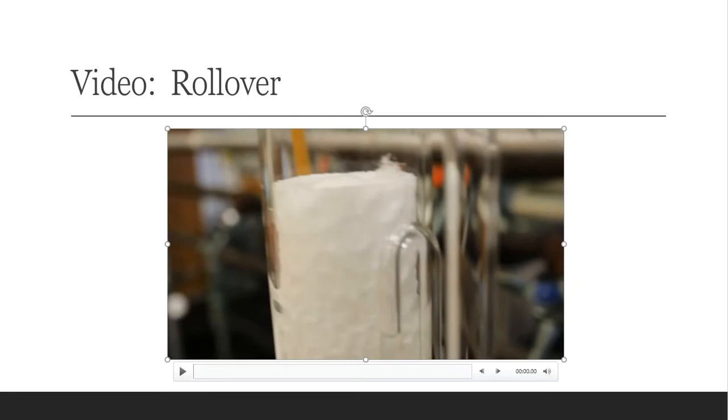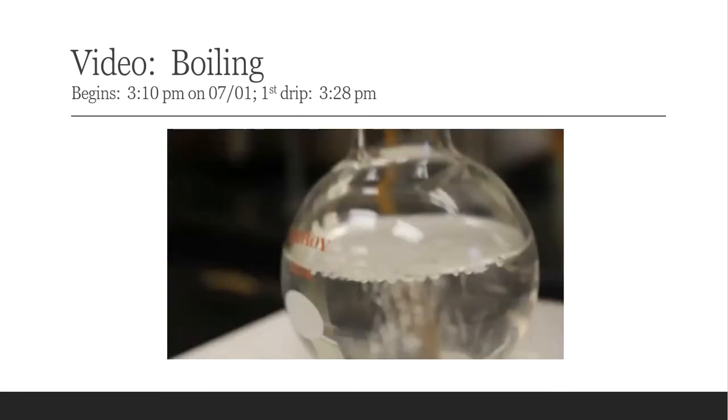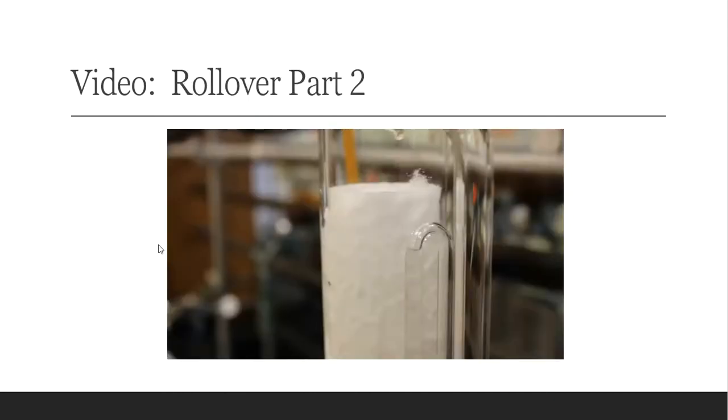Okay, so I also want to skip back and go back two more slides. Notice up here at the top, I do give you a date and timestamp on when I begin to heat it and when I see the first drip in the Soxhlet extractor. That will give you an idea of how long this process is actually taking. So back to the rollover, I'm going to show you the rollover in action.